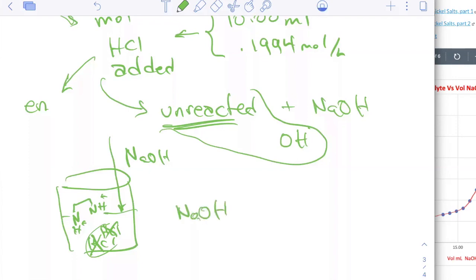it is a strong base. The hydroxide is going to look for any chemical in that solution that will offer it some hydrogen. Guess what? This ethylene diamine that you have, that was just protonated by hydrochloric acid, that chemical right there can deliver hydrogen to the hydroxide.